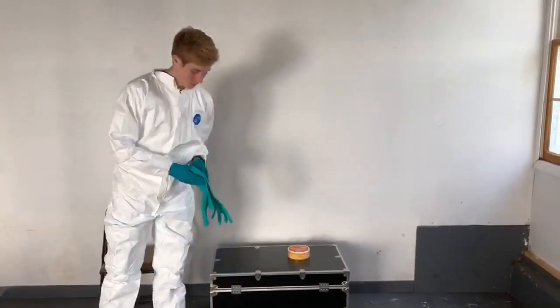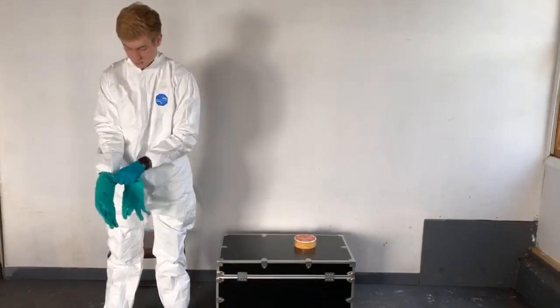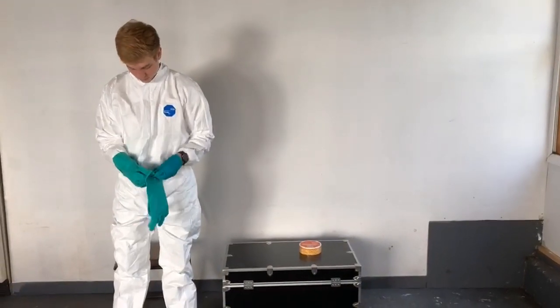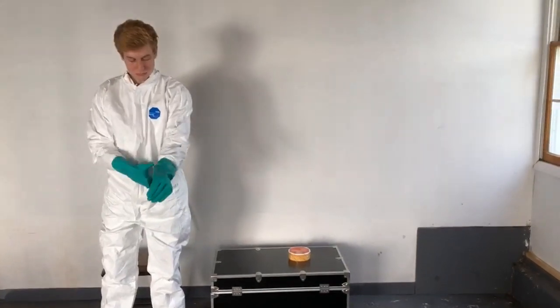The last thing he's going to do is apply the outer glove. Remember we're using a two-layer glove system: the outer glove is intended to receive the contaminant material, while the inner glove is the last line of defense and the last thing that's going to come off after we remove this garment.